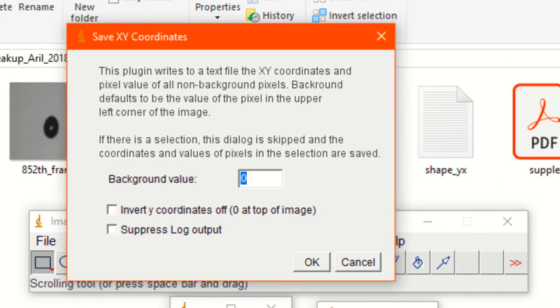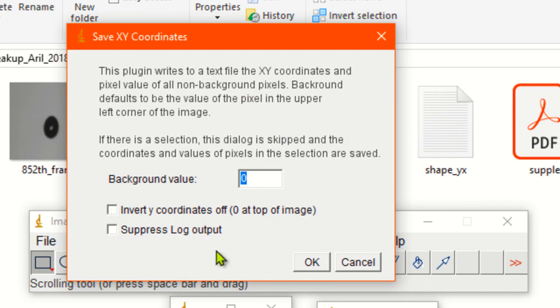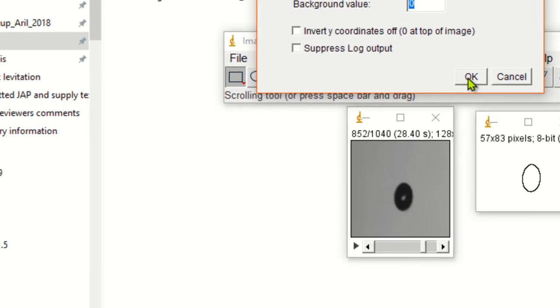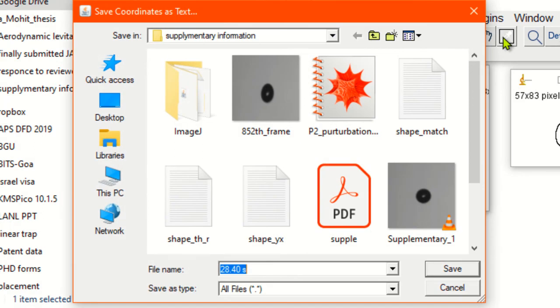Click on this. We will keep the background value zero and we will not invert the coordinates. Simply click OK.